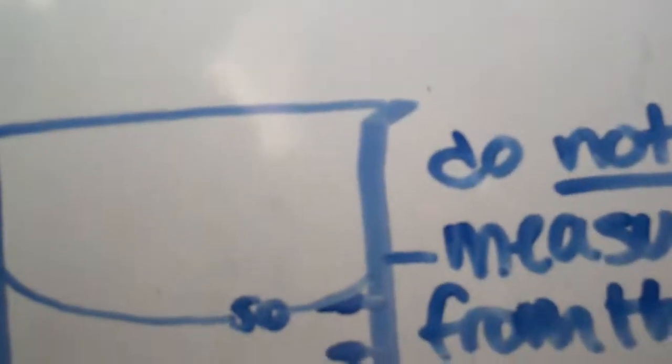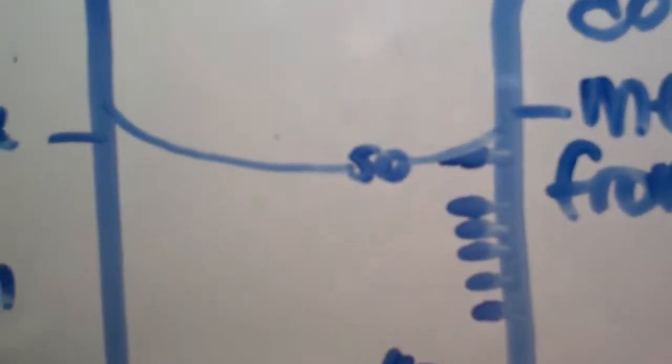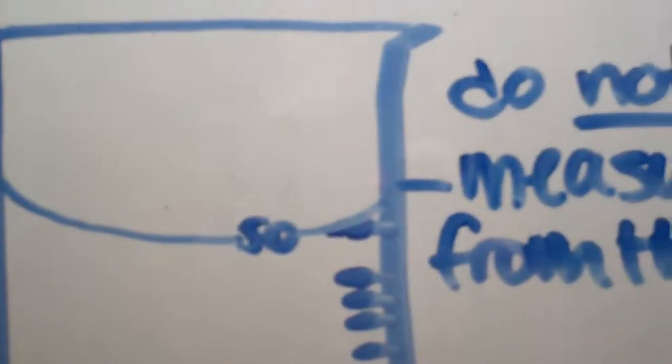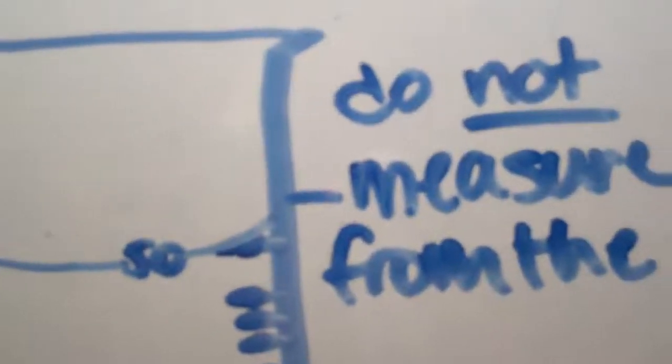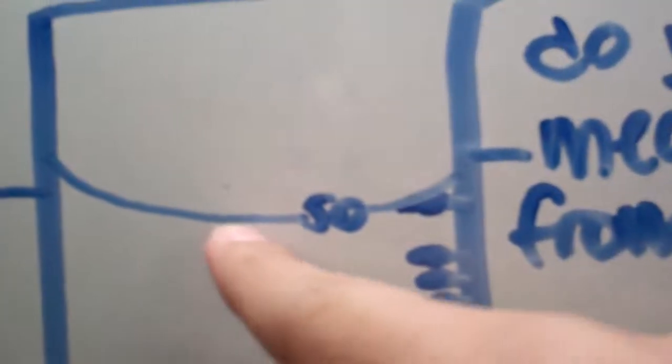Hi, I'm Uriel, and this graduated cylinder is filled with water to about 50 milliliters. It seems like it's 50 milliliters, but because of the meniscus, which is this curved line in the water, it may or may not be around 49 instead. When you measure the meniscus, make sure that you measure from the bottom, not the top.